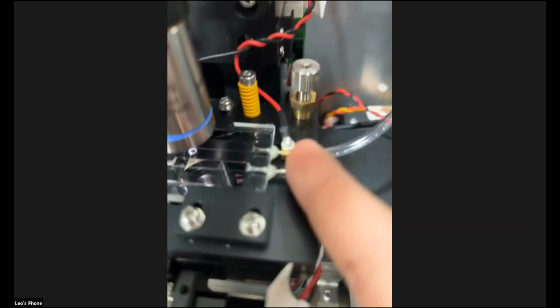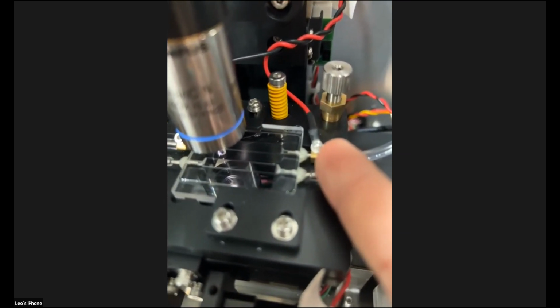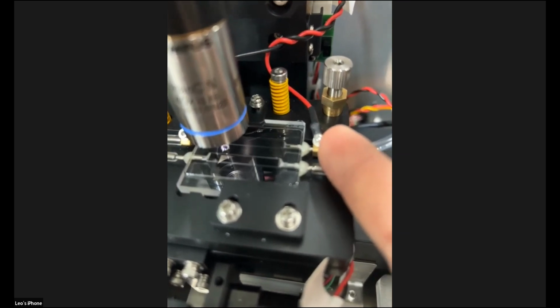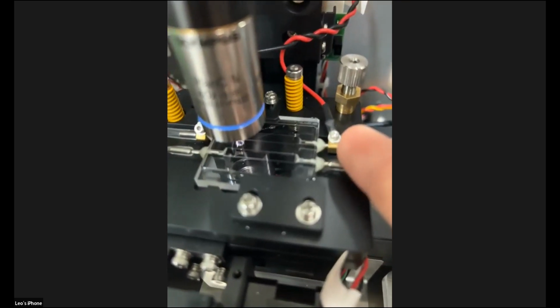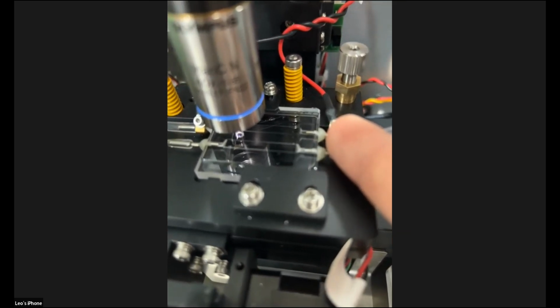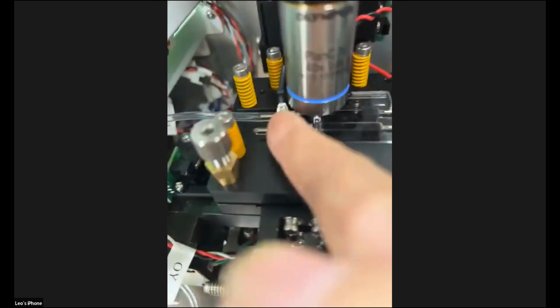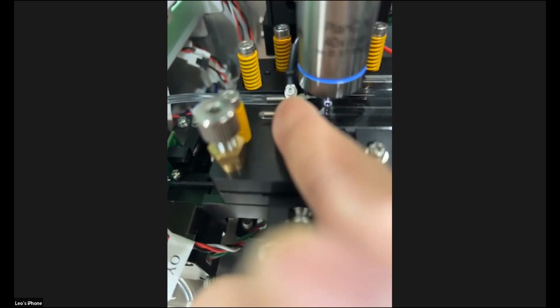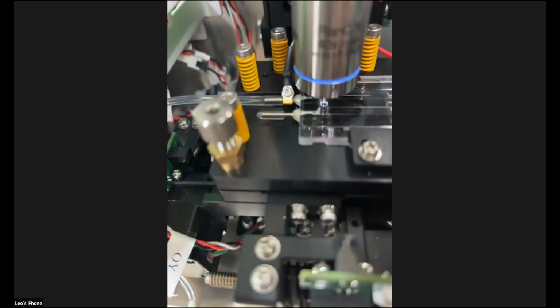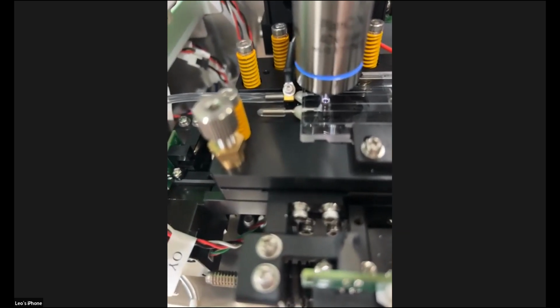Can you see clearly? Here is a metal screw that connects to the metal part of the flow chamber. This is the top and this is the bottom. There are two screws and the metal to connect the flow chamber from bottom to top.